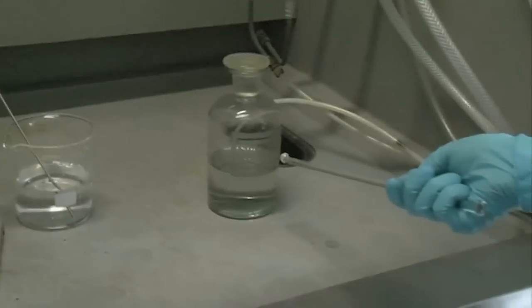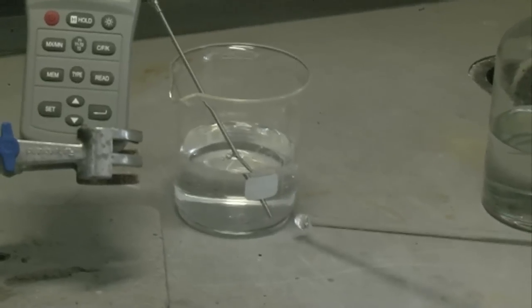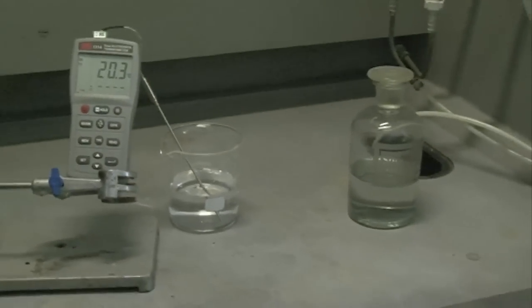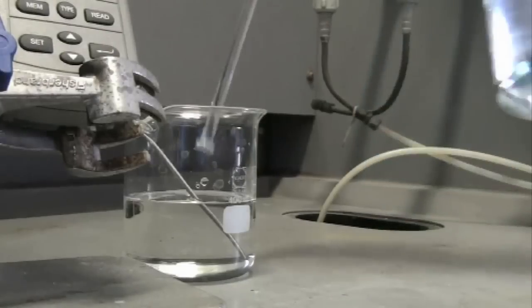So what we have is the sulfuric acid in here. In here I've got a pointy stick, it's very good. We've got some water in here, and this is a thermocouple, so it's going to measure the temperature in the water. Because when you mix the acid and the water, even though they don't react, you generate a lot of heat because you're forming hydrogen bonds between the acid and the water. And the result is, if you drop the water in the acid, the water boils instantly and the acid spits out. And if you're looking closely, it spits out onto you. Now, I have had this spitting.